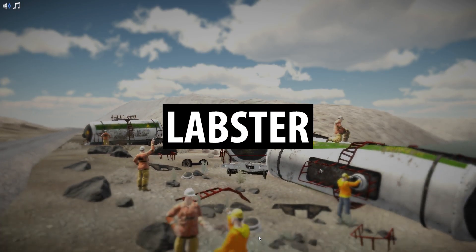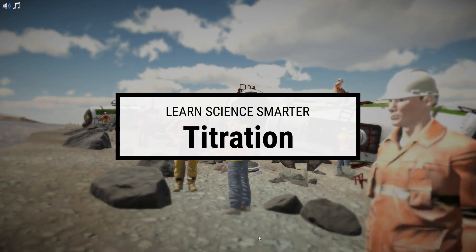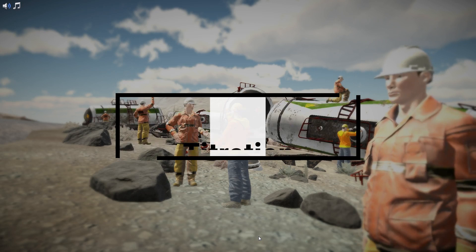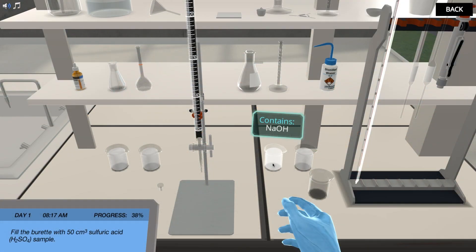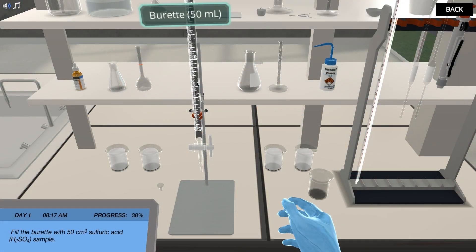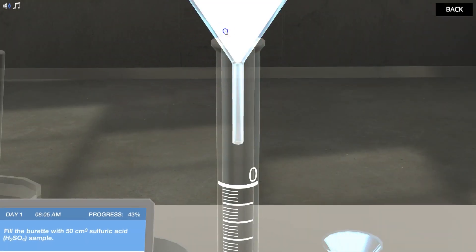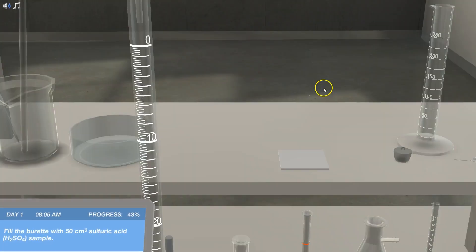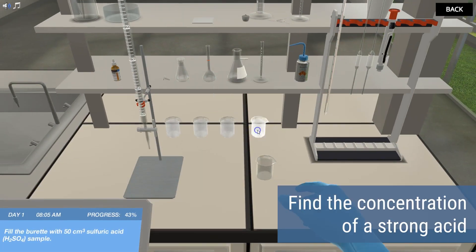Drop the base and play with acid. In this titration simulation, you are equipped with alkali, pH indicators, and burettes. With these basic supplies, you embark on the mission to find the concentration of a strong acid.